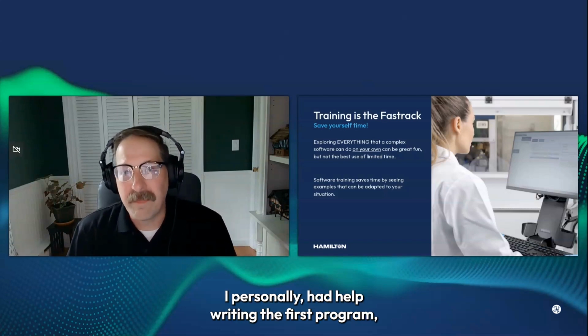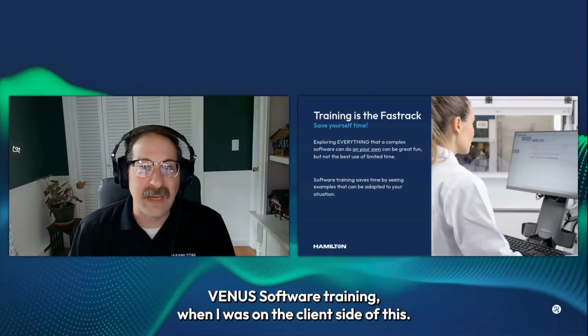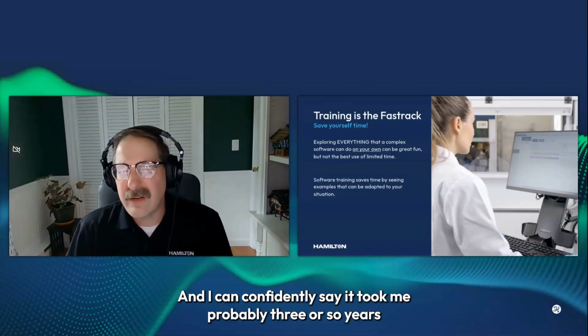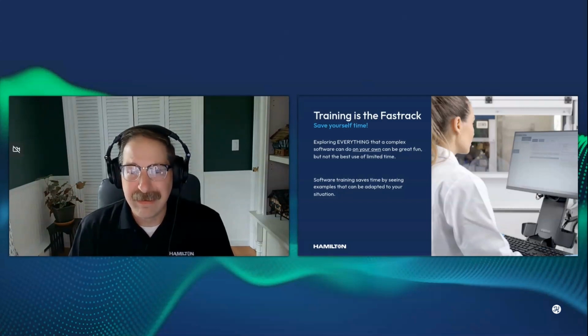I personally had help writing the first program, but then I never got a chance to go to an official Venus software training when I was on the client side of this. And I can confidently say it took me probably 3 or so years to run into all the steps and concepts that we go through in Venus Basic in about 3.5 days.